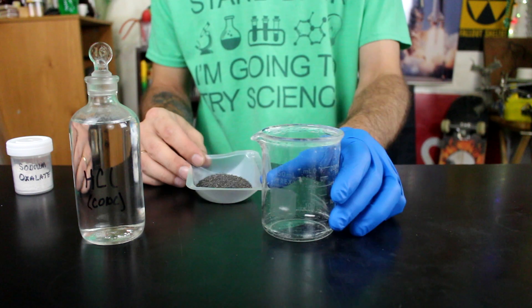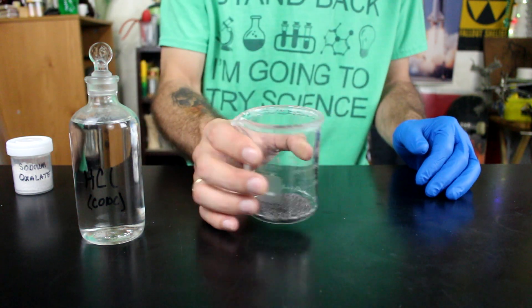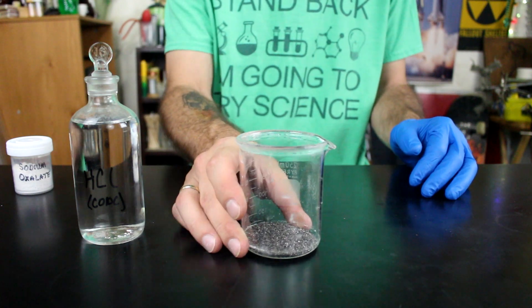Alright, so the idea is simple. We dissolved the iron metal in hydrochloric acid. This is pretty concentrated stuff, so it shouldn't take us too awful long, I wouldn't think.